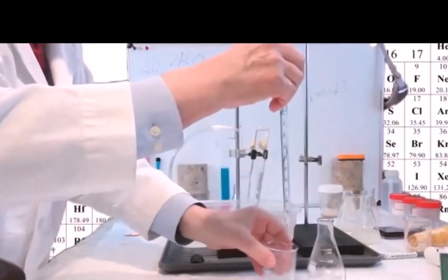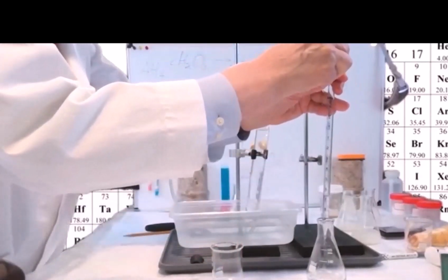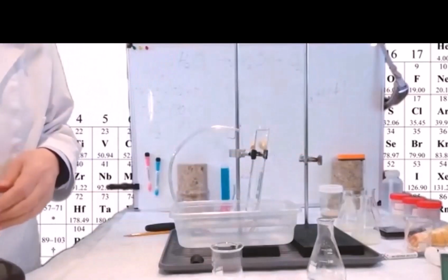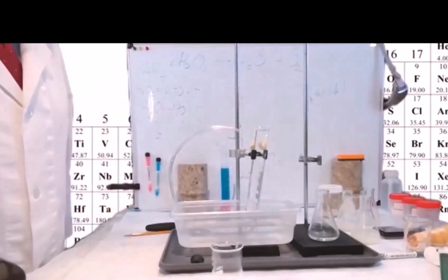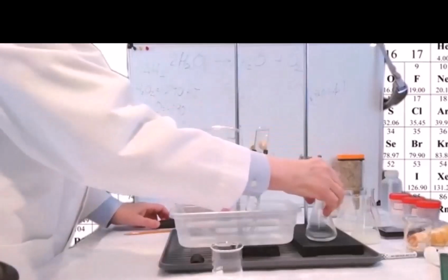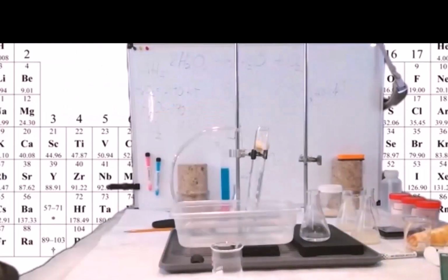Step 3, this has got a side thing that lets air come in, and your hydrogen peroxide from 0 to 9, I've dispensed 9 mLs of hydrogen peroxide, which is 3%, 0.88 molar, into here. The pipette bulb that you see here is probably going to be out of date soon. If you work in a good college lab, they'll have a digital pipette for you. And not only will you not be pipetting by mouth, that's how I found out acids were sour. I just transported to this side.